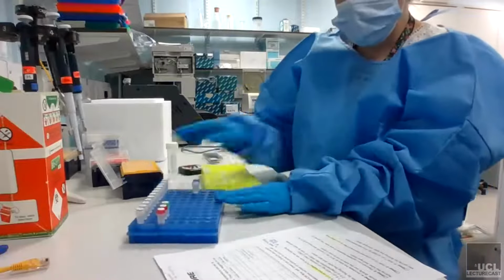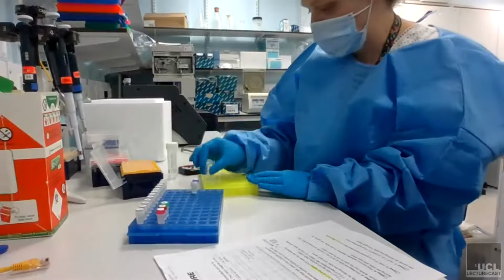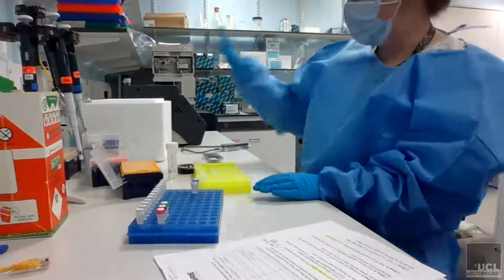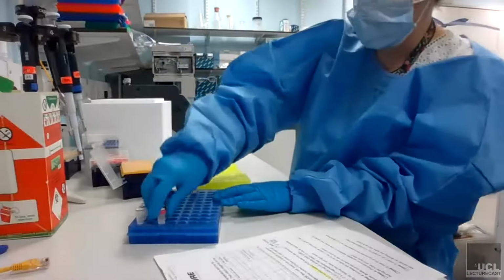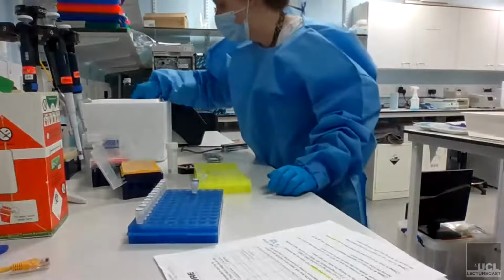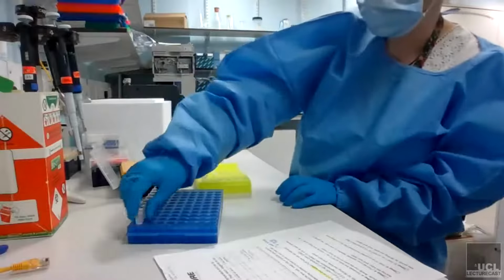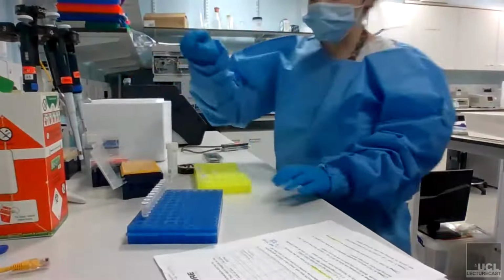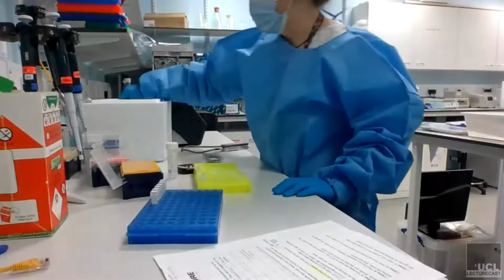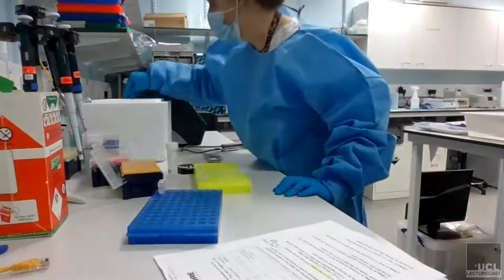So Nanopore suggests that you thaw all of the reagents at room temperature, and then you can put them on ice. So I have been thawing these at room temperature, and now I'm going to put them in my ice bucket so that everything is cold. Feel free to ask questions as I go through. And as I say, this is just a test run rather than a real run.